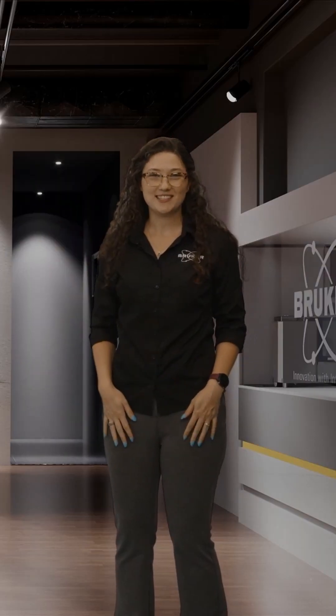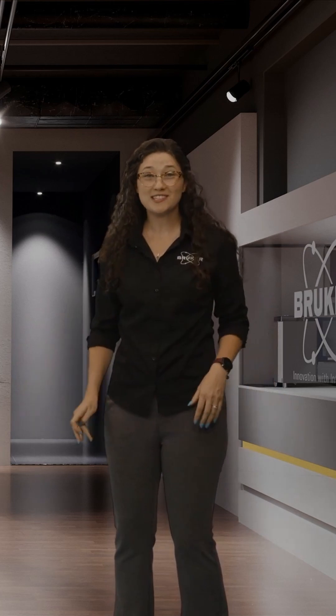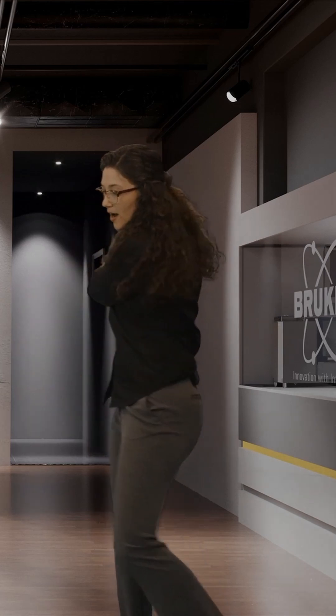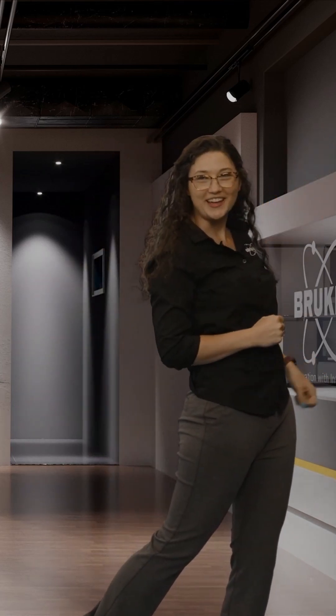Hi, I'm Ashley the App Scientist. Congratulations, you grew a crystal! Now what? In this next episode of APEX, The More You Know, I'll show you how to mount and center your crystal so that you are teed up to start collecting data.